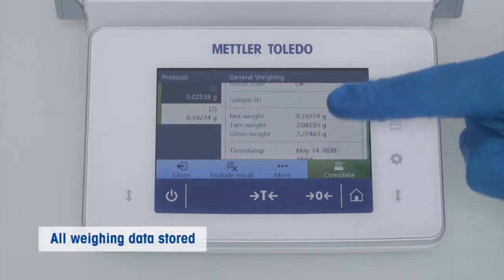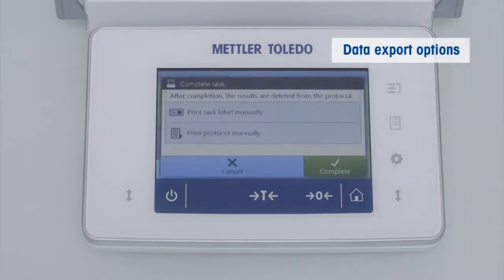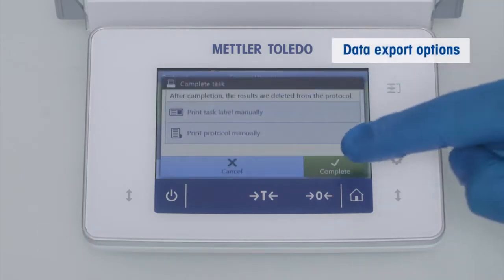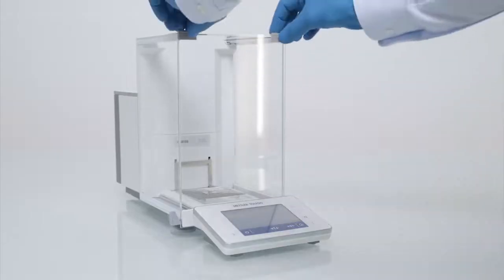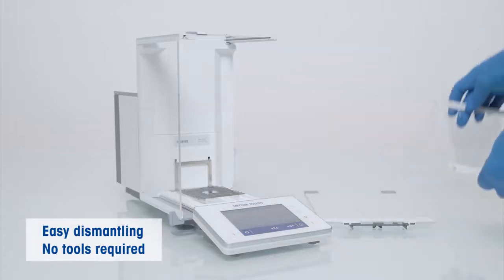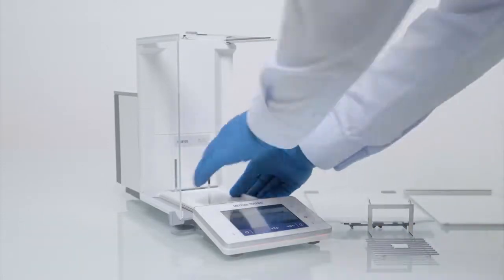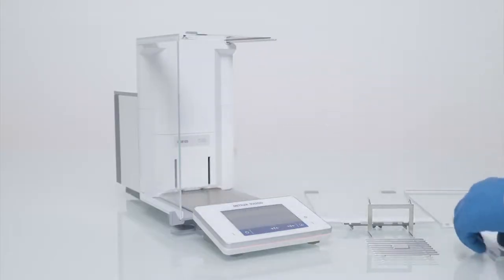Completing the weighing task by pushing the complete button either prints them or sends them to a connected PC or a backend system. After weighing the balance can be quickly set back to the initial state for the next weighing and if required all relevant parts can be removed and cleaned quickly. Putting them back into position is equally easy.